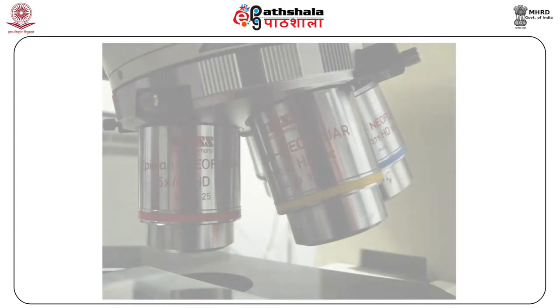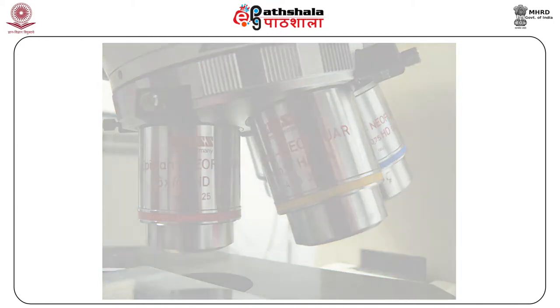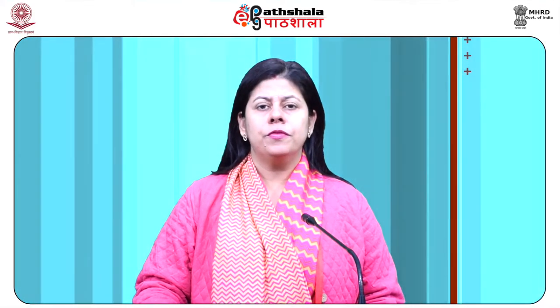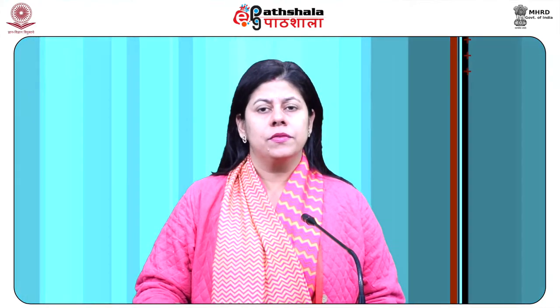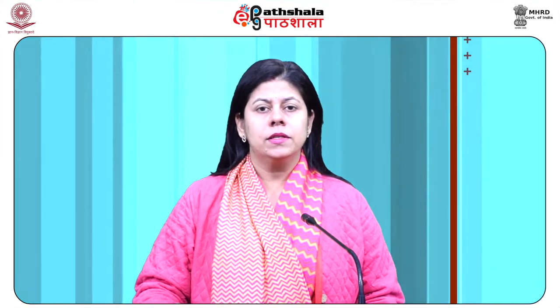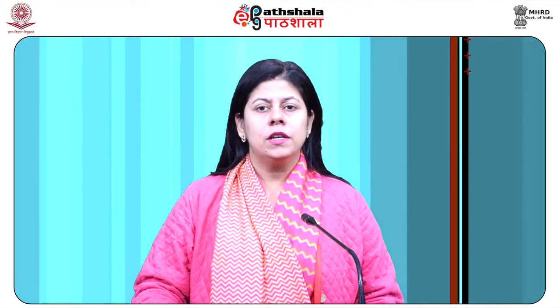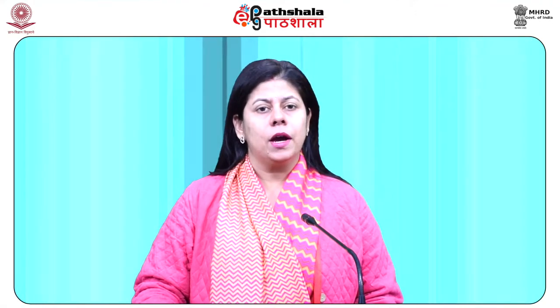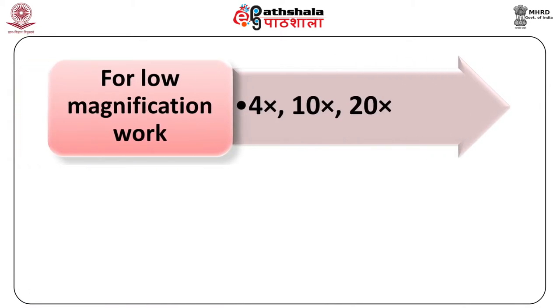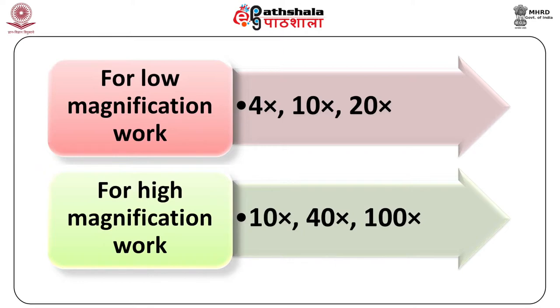Objective lenses. On a typical compound optical microscope, there is a selection of lenses available for different applications. Many different objective lenses with different properties and magnification are available. Typically, there will be around 3 objective lenses: a lower power lens for scanning the sample, a medium power lens for normal observation, and a high power lens for detailed observation. The typical magnification of objective lenses depends on the intended application. A normal group of lens magnification may be 4, 10, 20 times for low magnification and 10, 40 and 100 times for high magnification work.